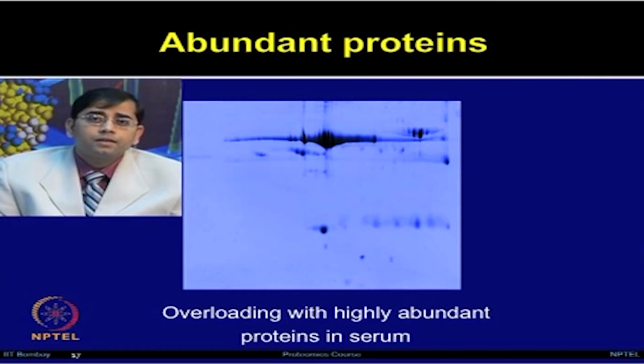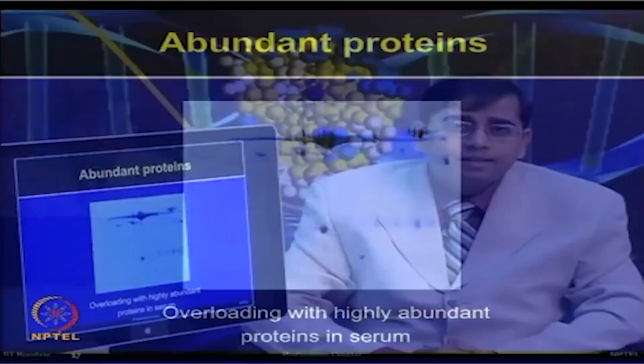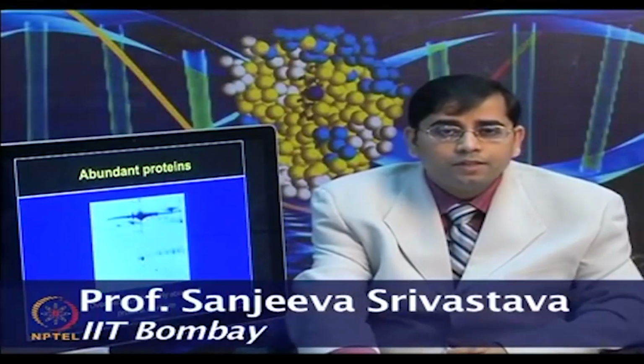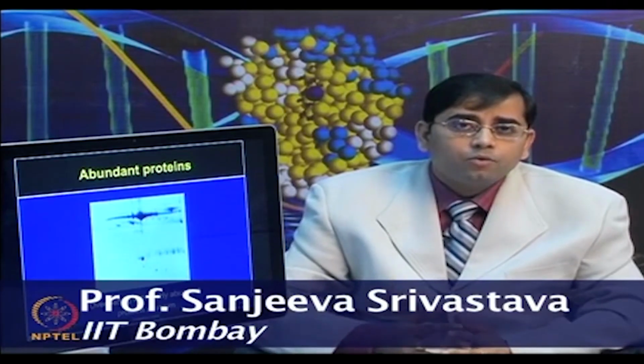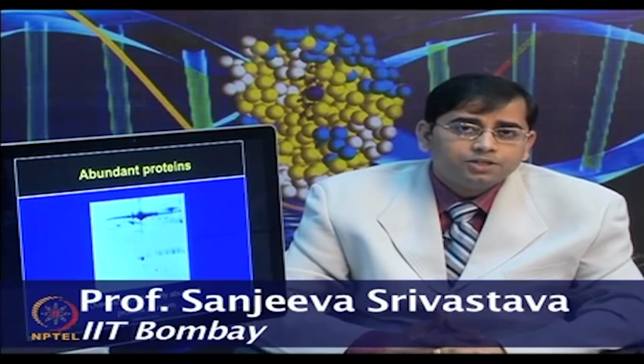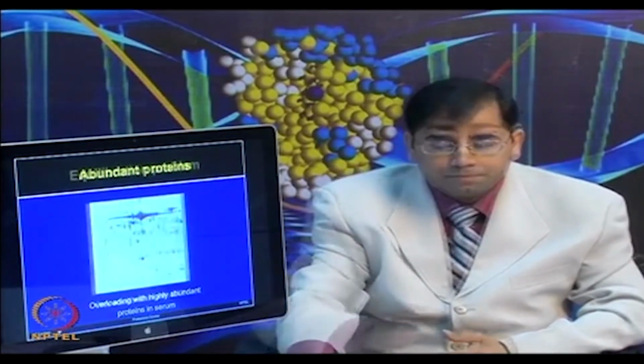So, in this gel, it is shown that human serum contains highly abundant proteins, which are visible in this area. There are various ways one can overcome these limitations. In the previous class on protein extraction and sample preparation, we talked about how to remove the highly abundant proteins. So, please refer to that lecture to overcome this limitation.